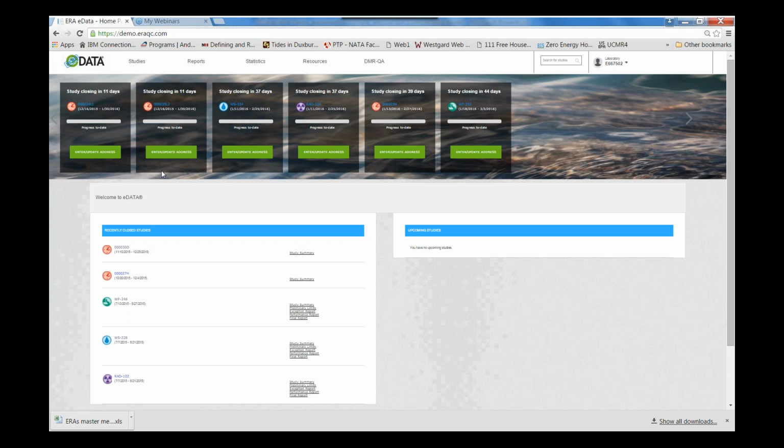So now in our next scenario, we're going to take a look at that same laboratory where we know we've had a result that wasn't acceptable for the lead and the nickel. The next thing we've got to do is to obviously conduct a root cause investigation, and we've got to take corrective action to maintain our accreditations.